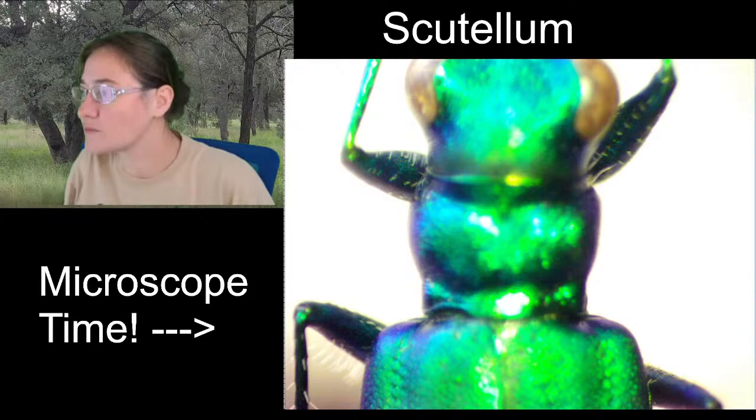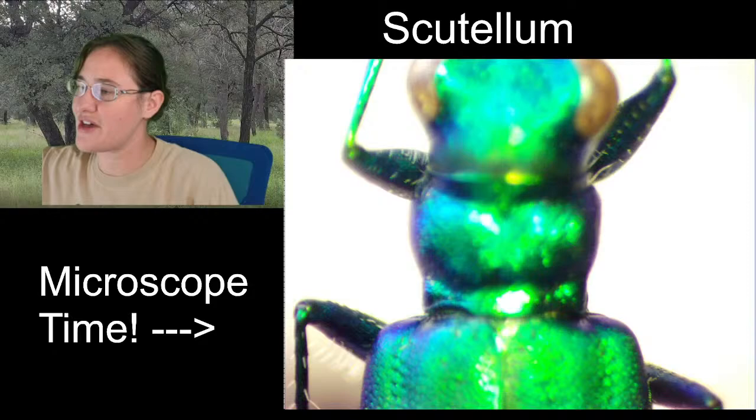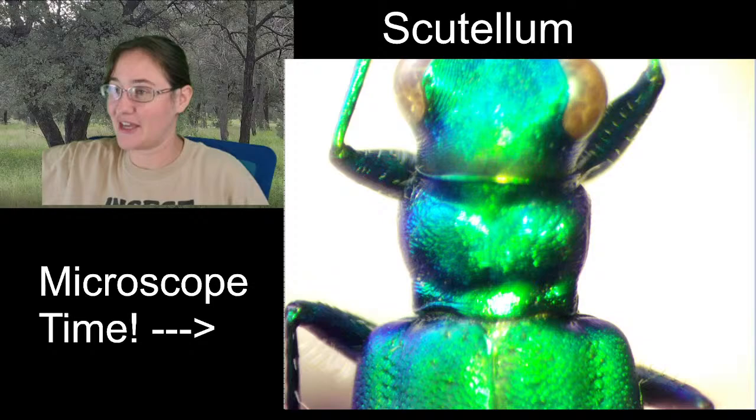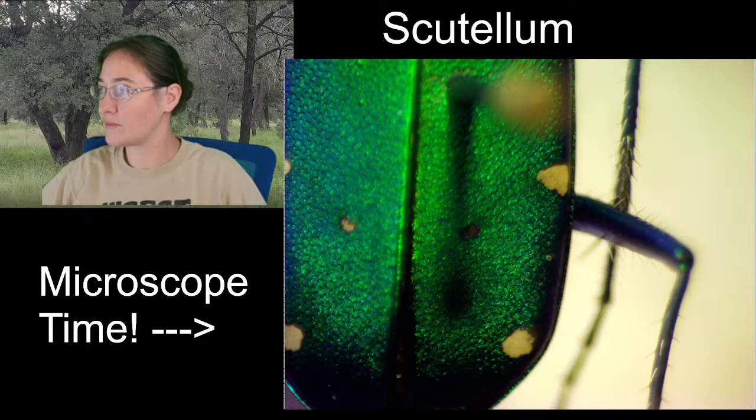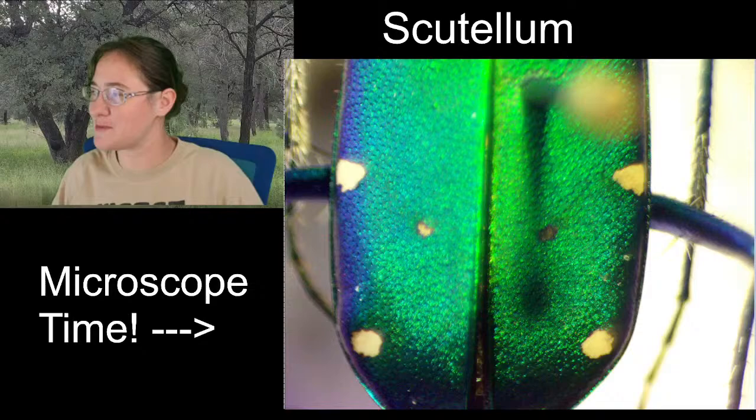Susan asked, oh, forgot to check on the head. Are there ocelli? No, tiger beetles do not have ocelli. Oh, I was wrong about it being an acute scutellum. It's more like an equilateral scutellum. Oh, that's funny.